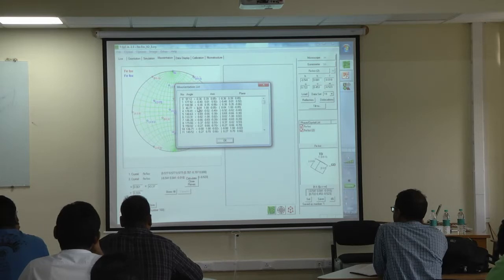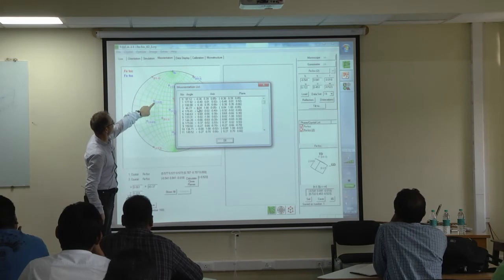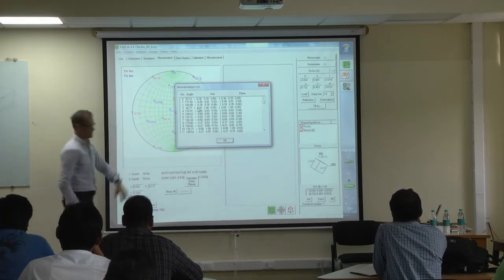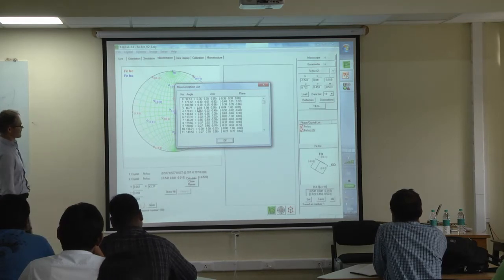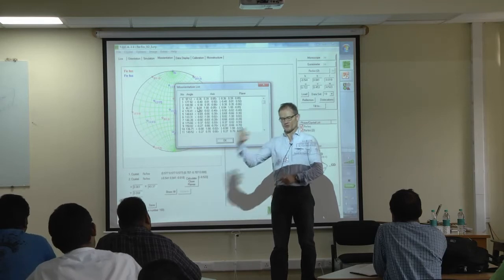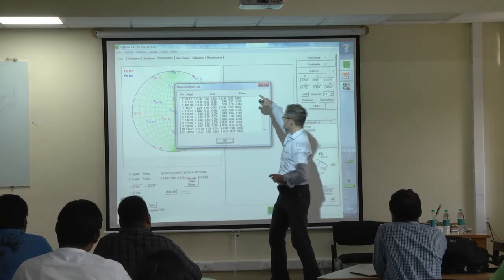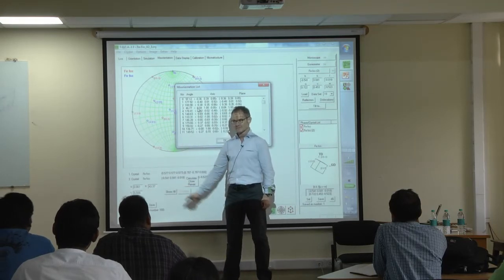I selected something special. We see here that there are obviously some overlapping planes as well. I rotated by chance, I believe, such that a special misorientation is formed. Anyway, this is the definition. And every software which is used for that knows this and needs to do all these calculations first before it can propose to you that the misorientation is that.